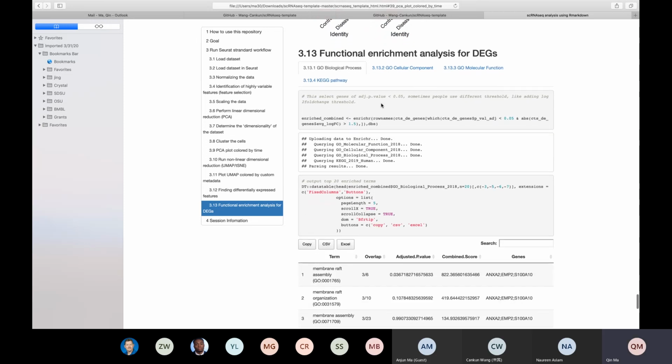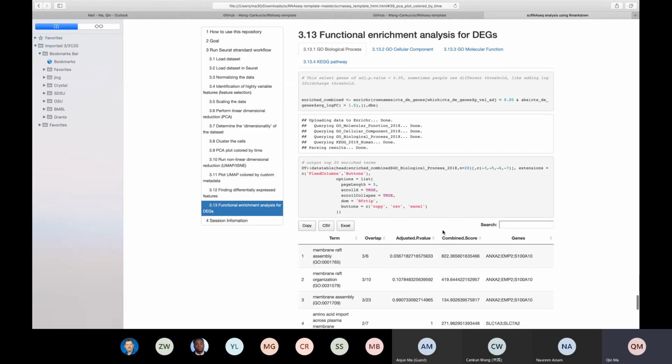Based on these subtypes, we have 4 categories. Because this is the example data, the p-value is not very significant. Only one of them is less than 0.05. Majority of them make no sense. That's because we only picked 10 genes, I believe. So this usually will not lead to a lot of useful information, but just showcases the results.